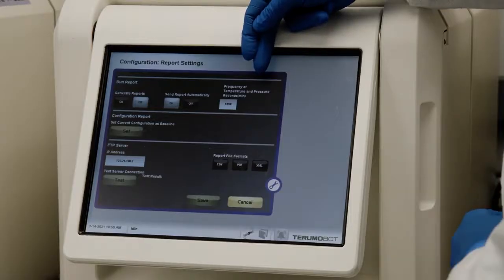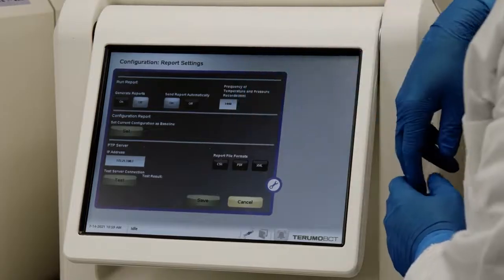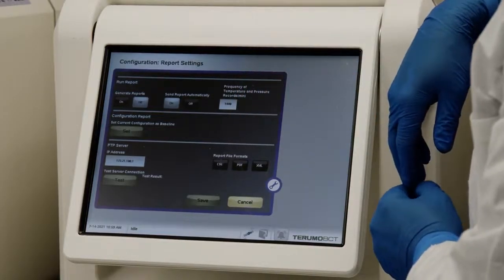The run reports can also be exported into three different formats: an XML, a CSV, or PDF for integration into your current laboratory management system.